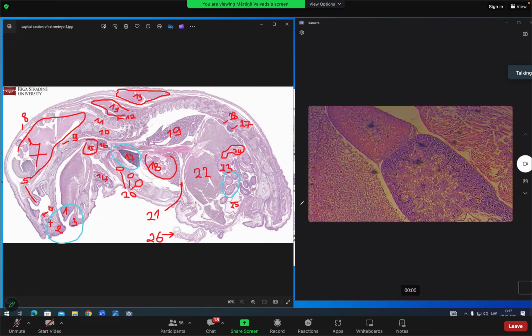If you see these three areas, you can understand the regions. If you see the thymus, you know that you're in the thoracic cavity. If you see the intestines, you're in the abdominal cavity. And if you see the start of the mouth, the tongue, you're in the oral cavity in the head region. If you understand this, then you can navigate through the slide.